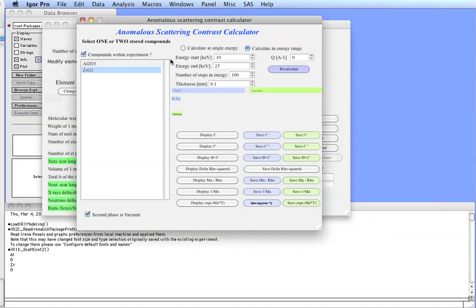Okay, that's all which can be done, or most of which can be done, in the scattering contrast calculator. In this specific case, I was showing an example of a solid against void material, but, of course, you can do the same calculations between two solid phases. For example, precipitates in metal or other types of these calculations.